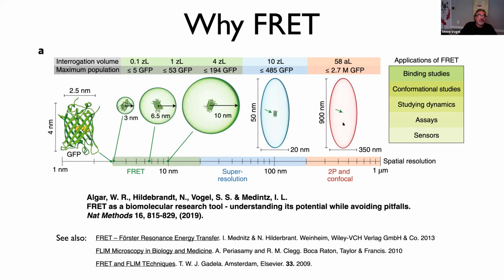Now we can move over to the blue ellipsoid. That's representative of super resolution microscopy. And you can see things got a lot better. The resolution is much higher than here.